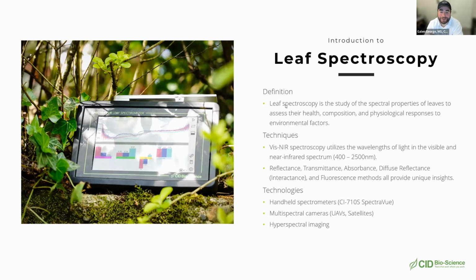Is there a problem if small leaves overlap when trying to cover the area with several of them? So yes, overlapping, that's a great question. I'm sorry, I did not qualify my statement earlier with that, but overlapping is going to cause problems if you're doing any sort of transmittance or absorbance-based readings, because you're increasing the thickness of that sample. So you definitely want to try your best to get a single layer of the leaves on that window. To the best of your ability, you don't want to overlap. So thank you for bringing that up. That was a great question.